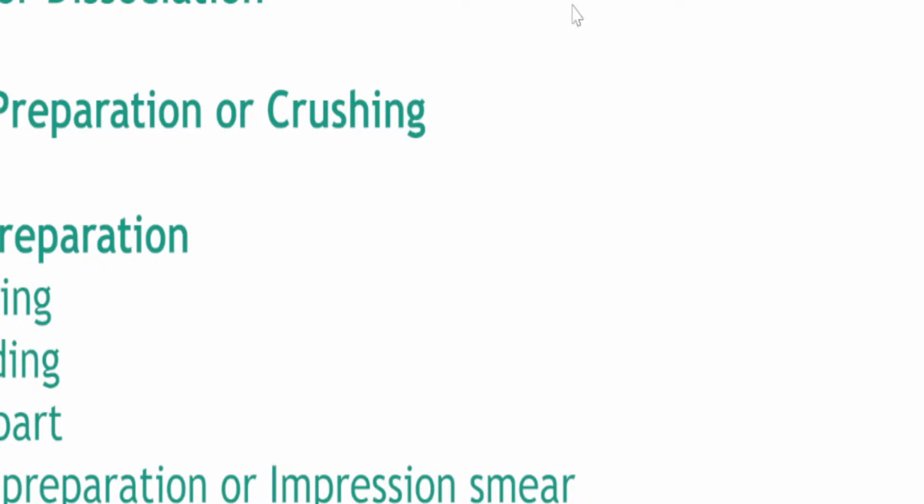Okay? So fresh frozen sections, these are basically what you do when you have a cold microtome outside of the operation theater, or we call it operating room in the Philippines. So we'll have a separate discussion for fresh frozen sections. Fresh frozen sections is important.